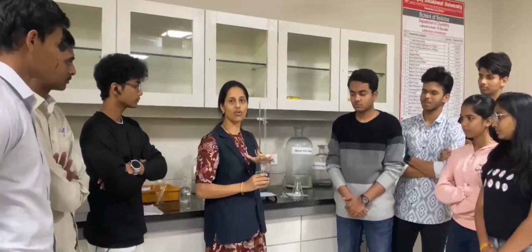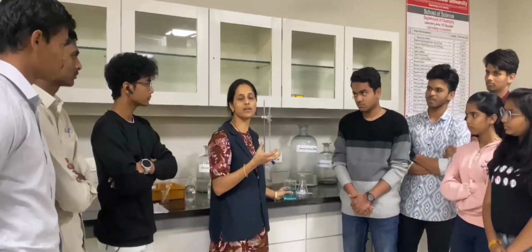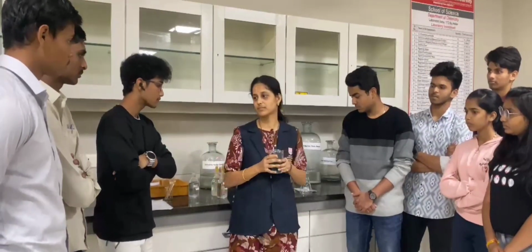By using the stock solution, which is prepared by dissolving copper alloy into concentrated acid. Prabhanjan will explain how this stock solution is formed.